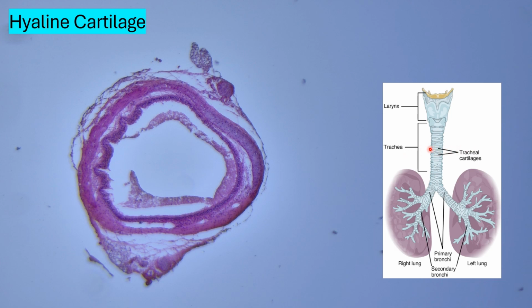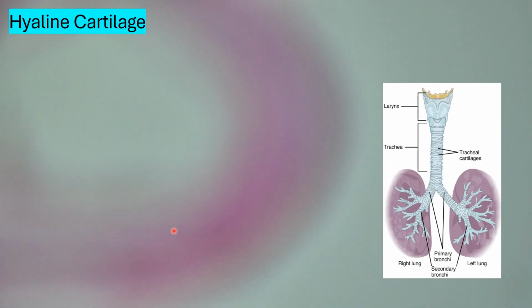If we cut right through the trachea, that's what we have here on this slide. Now we'll zoom in.